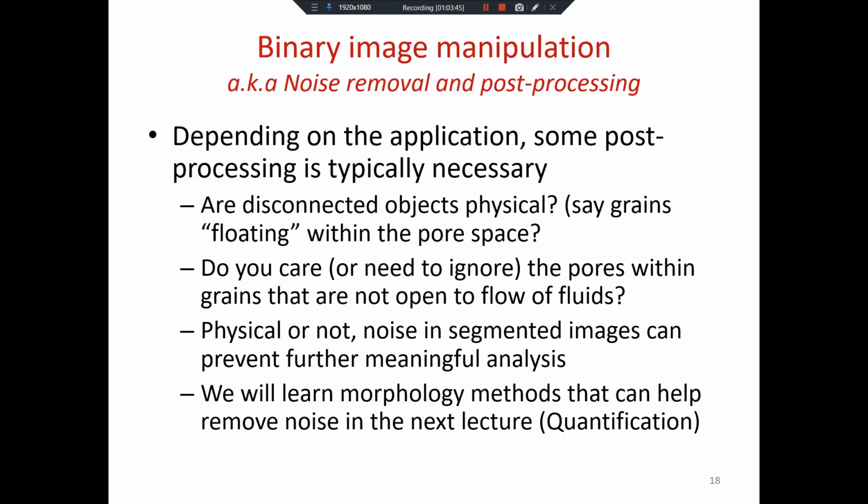So one thing, even in this world of segmented images, even if I've done some filtering on the image before segmentation: we didn't actually touch the image, we didn't filter it. One could play with the image that we work with and filter it before segmentation. We didn't do that. You will still have to filter even your segmented result. This is a new image. No matter what, I pointed out that there will be misidentification in that image.